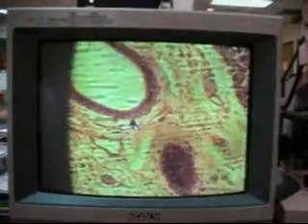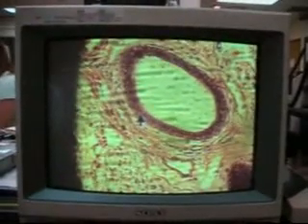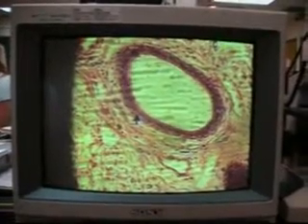You can go on now. This one, you don't want to get confused here. If you look at this particular vessel right here, that's not an artery, because if you look at the cells, these are almost cuboidal-like cells that you see there. This now is a duct, so you look carefully at these so you don't confuse a duct with a small artery.